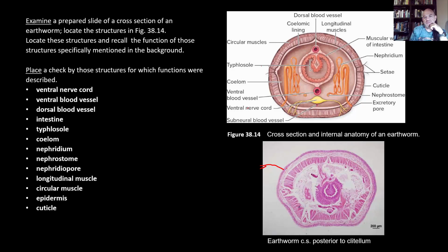And then the first layer of muscle going inward, which is this right here, that's your circular muscle. If you look close enough, you can see the strands of muscle cells going in a circular pattern all the way around. And that's going to be the ones when they contract, that squeezes down in the body cavity. It pushes on that fluid.